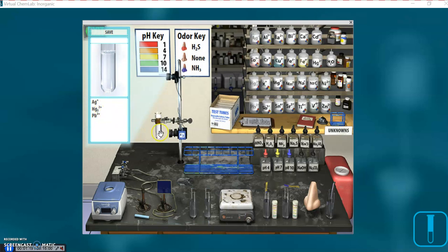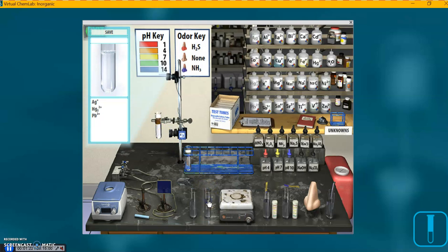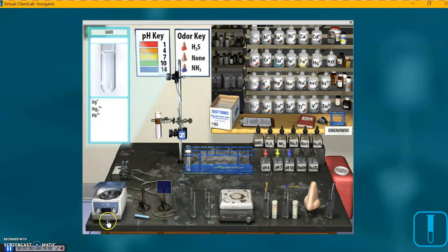And before we proceed, I'm going over here to the Divide button. Click that, see a test tube happens here. This duplicates what's in here, just in case we want to use it later, in case we make a mistake.